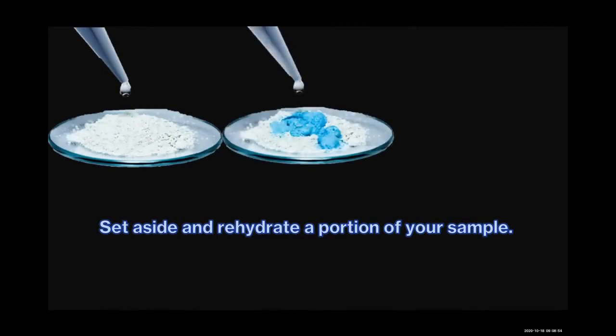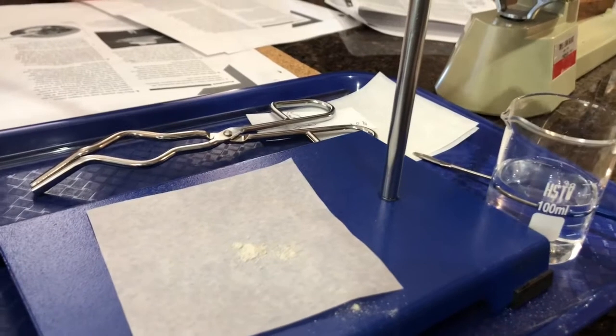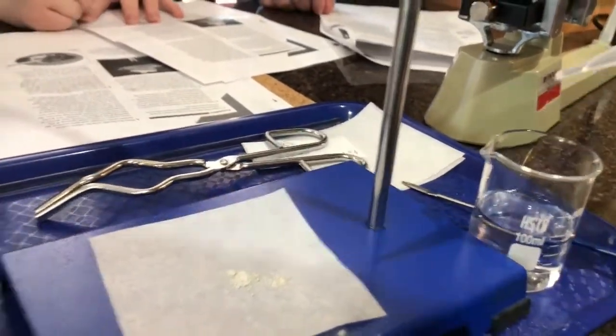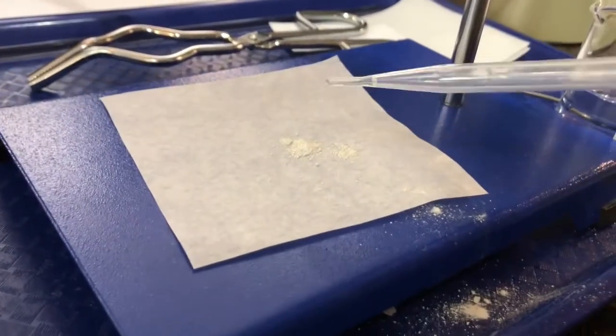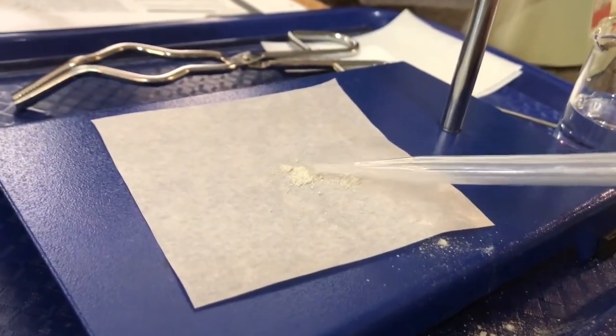Set aside and rehydrate a portion of your sample. It's broken. All you need is a drop. Okay. Is that a hole in it? Awesome.